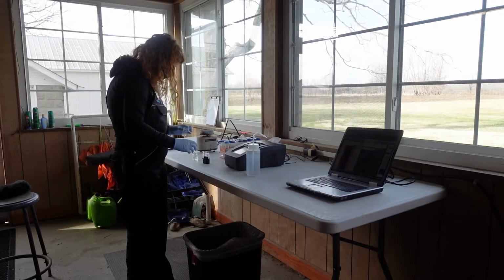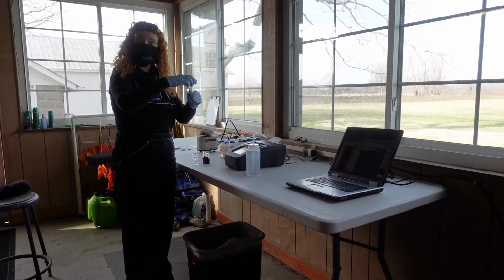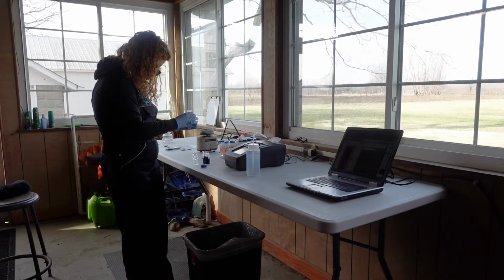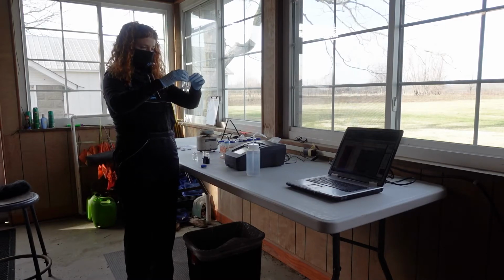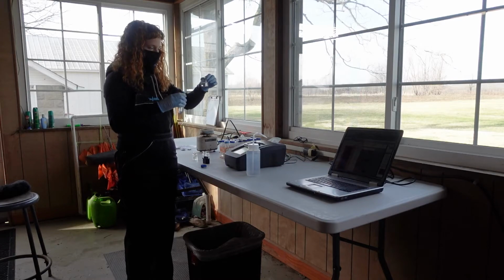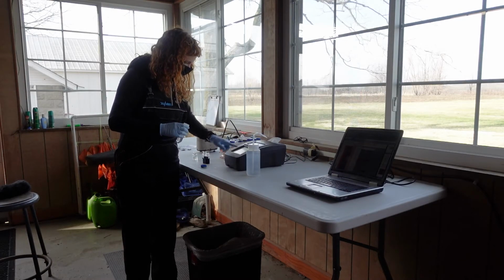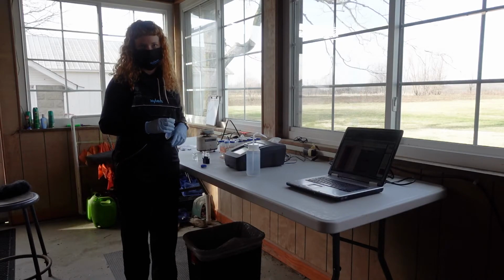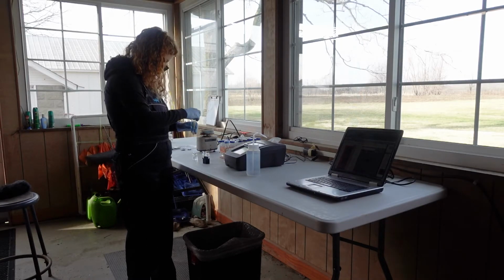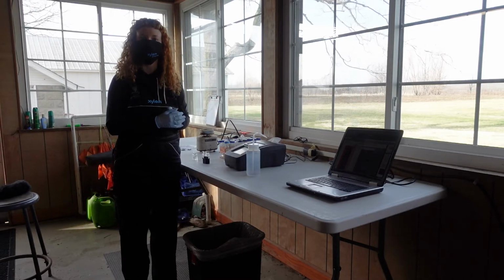This just minimizes error due to anything you might have on your glove. All right, so I'm ready for my next sample. I'll take my next tube. Remember, this is my one duplicate now. Sample number 1 duplicate. I'll do the same thing as before. Fill it up to the 10 milliliter mark. Place it in the instrument, close the window, and press read. And we'll input that into the spreadsheet as well in the next step.